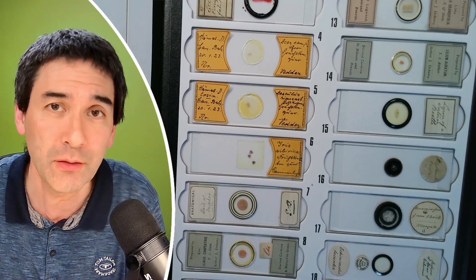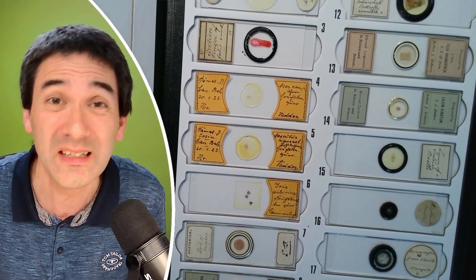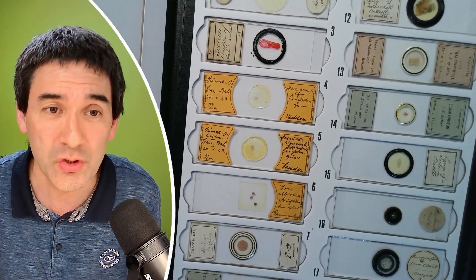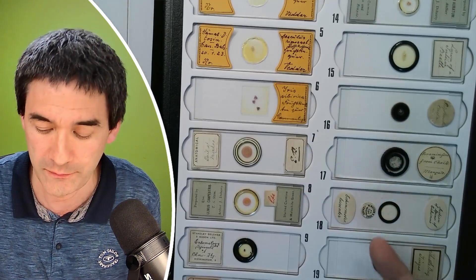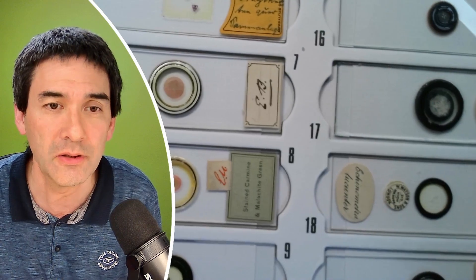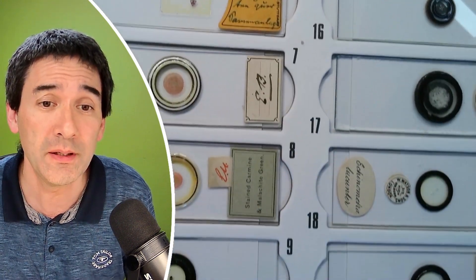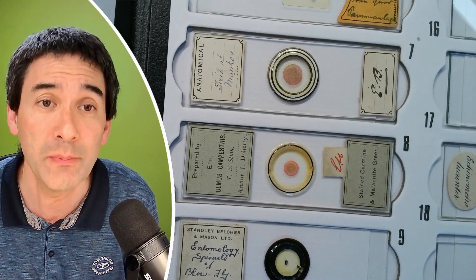That's one thing I would like to see on a microscope slide. Another thing that's missing, and I think even more important, is the date, or at least a year. These slides are approximately 100 years old because some are branded and have the name of the slide manufacturer. Let's zoom in a little bit here. Watson and Sons, for example. Basically these slide manufacturers — many of them are from Great Britain — were quite well known, and therefore we can estimate when the slides were actually manufactured.